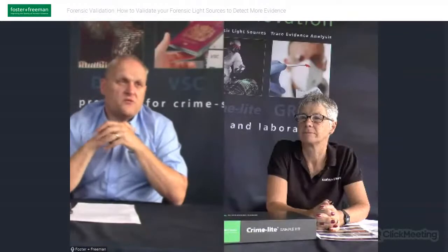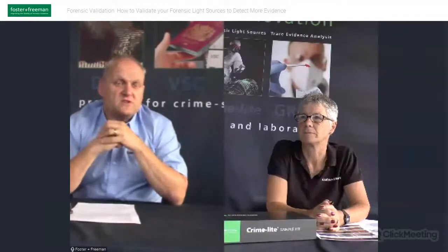So the way in which we go about that is generally by trying to use as many different wavelengths as possible. That said, based on our experience, probably if we had to pick one, we'd probably go with the green, which is one of the reasons why we've launched the Crime-lite LASER green, which is probably one of the best tools to use for untreated fingerprints. But it's impossible to give an answer as to which is the best, because the best one is whichever works the best with whatever the contamination is.